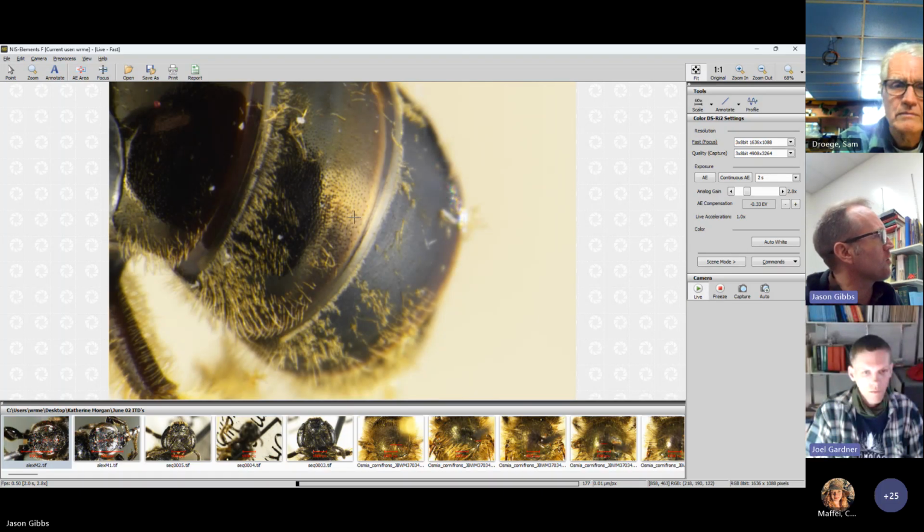If you look here, it's a pale, almost reddish brown in versatum. But if we show admirandum later, you'll see it's a really nice, clear yellow band, and that is something I look for in admirandum.